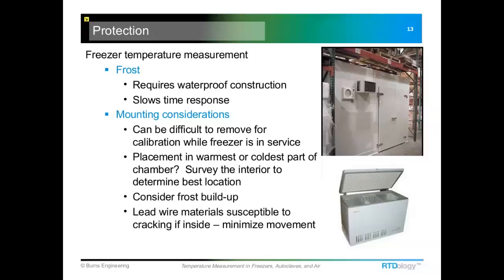Yeah, so we move on to freezers, and these have some other issues. First, the biggest one is water. Anytime that the temperature probe is taken out of a freezer, frost is going to accumulate on it, and it's going to melt, and then the thing is going to be sitting there in a pool of water.